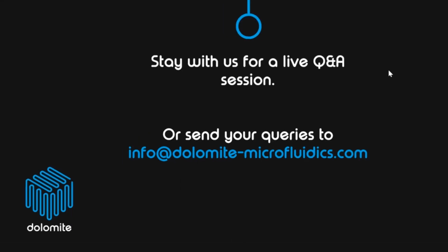Okay, so do we have a complete comparison between conventional stirring mixing method and microfluidic system? Maybe the particle size tunability is achievable by conventional mixing as well in that range? I think I get the first part of this question. So yes, there's a complete comparison definitely available in terms of comparing microfluidic systems to conventional stirring methods, and you will find the conventional stirring methods do lack in terms of how much you can tune particle size.